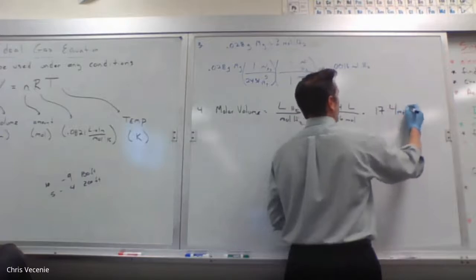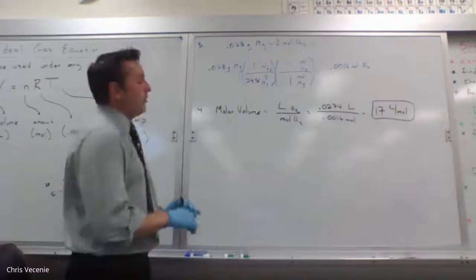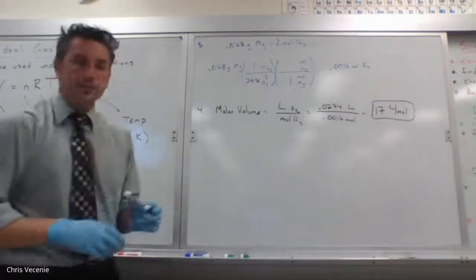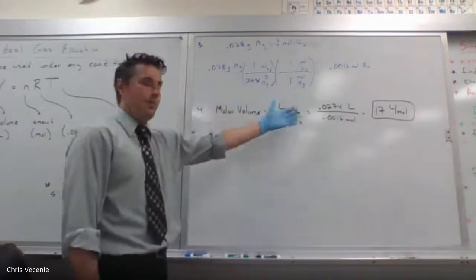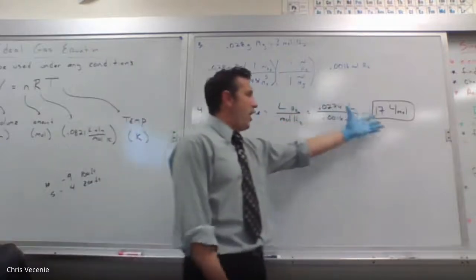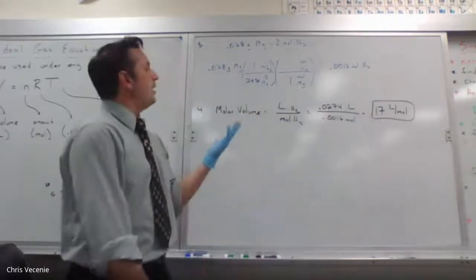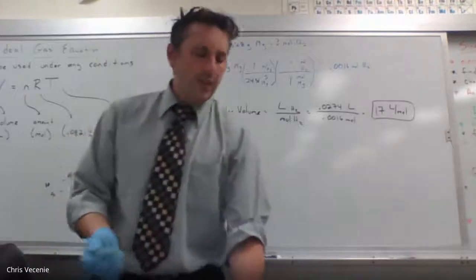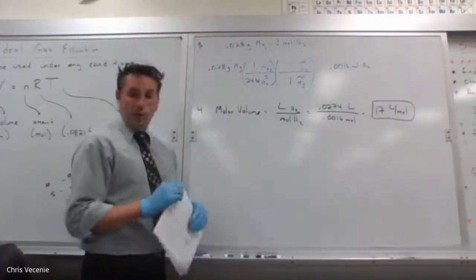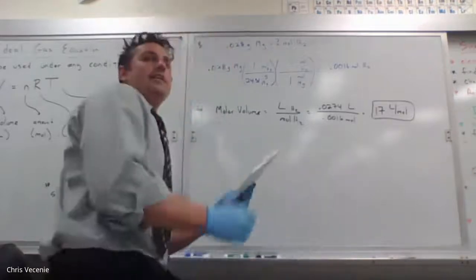liters per mole. And remember, the accepted value for that would be the 22.414, right? We converted it into STP so we could get what we thought it would be. Our experimental was 17 liters per mole, right? And our accepted would be the 22.414.